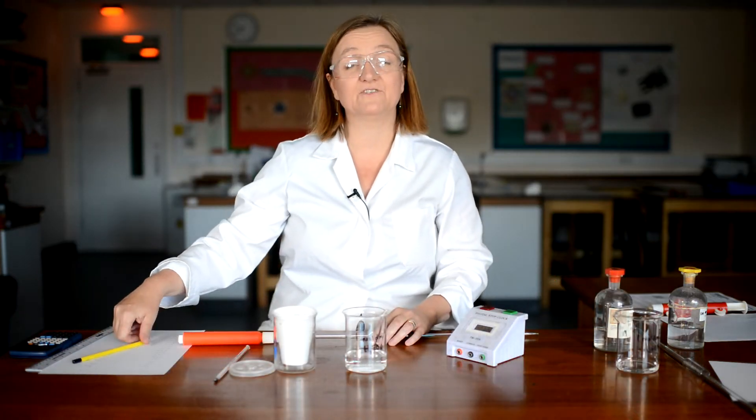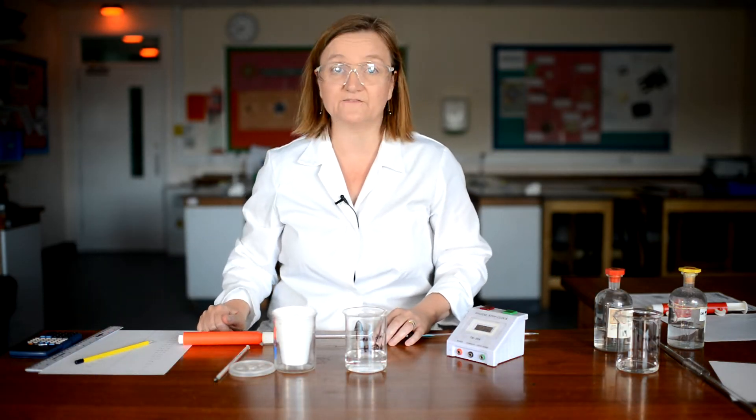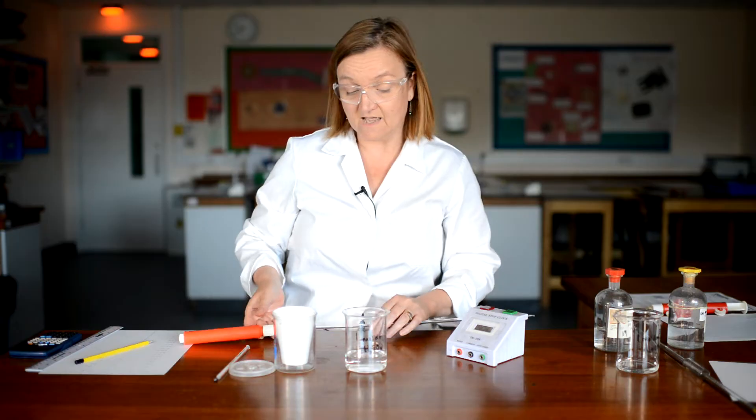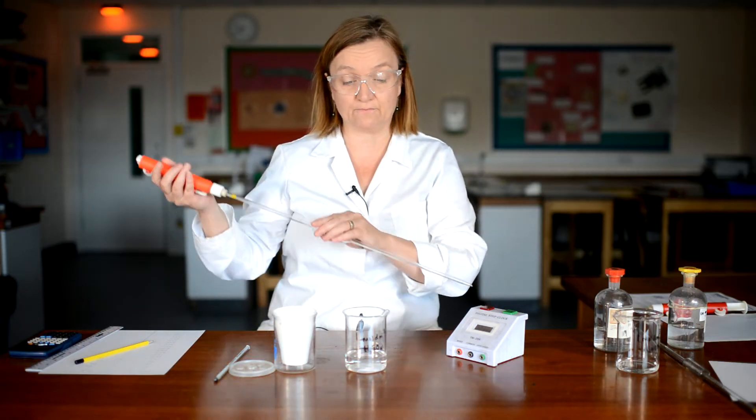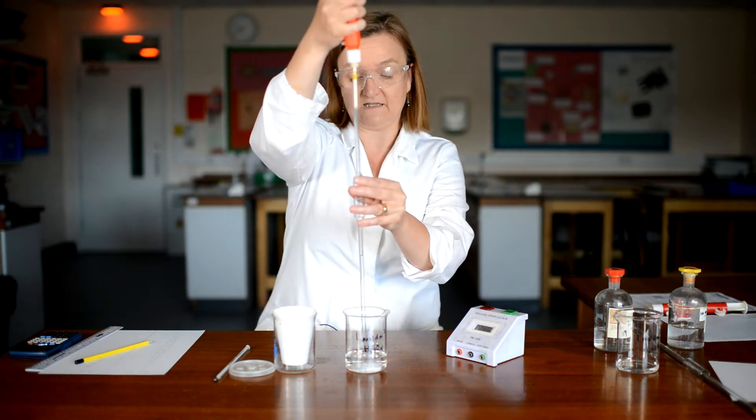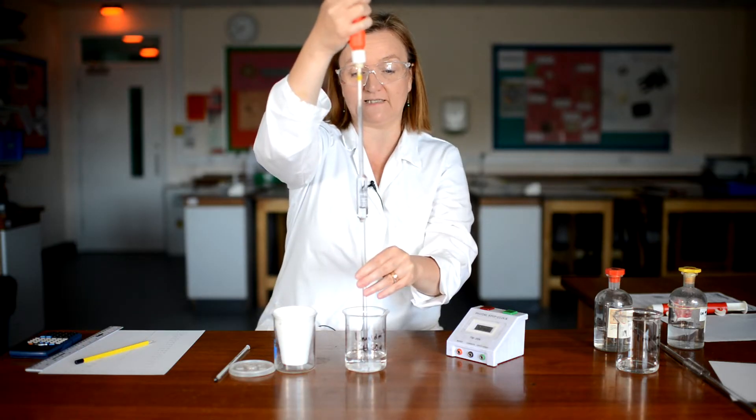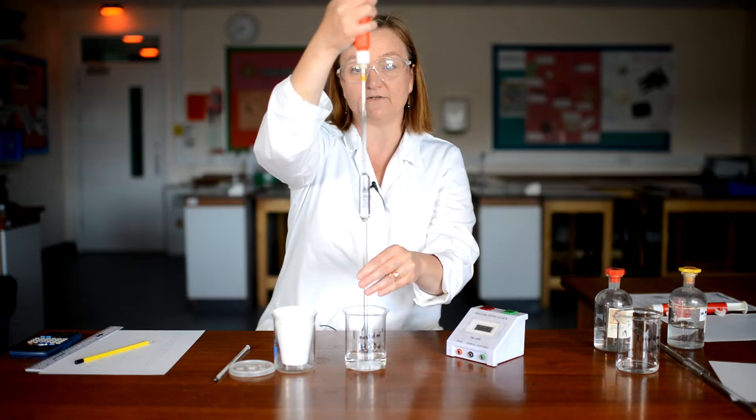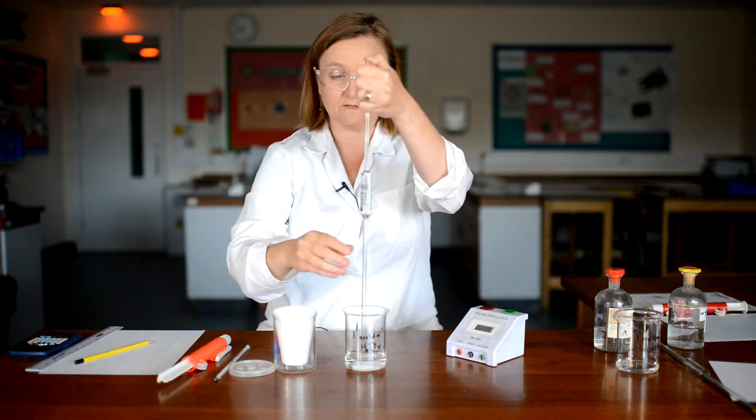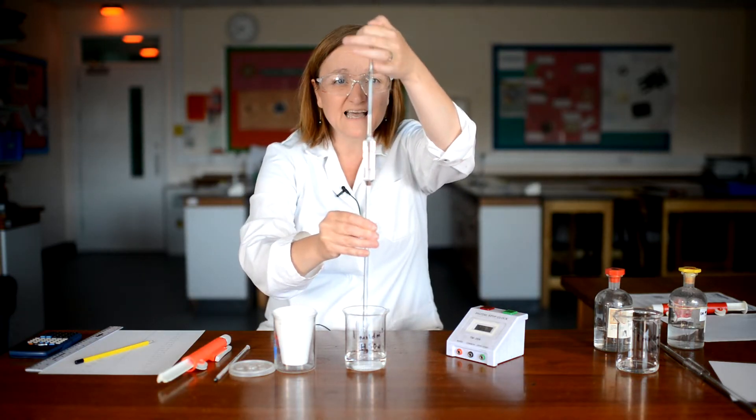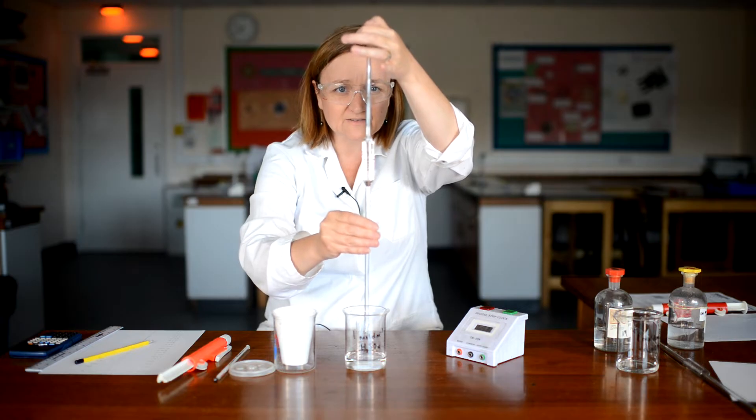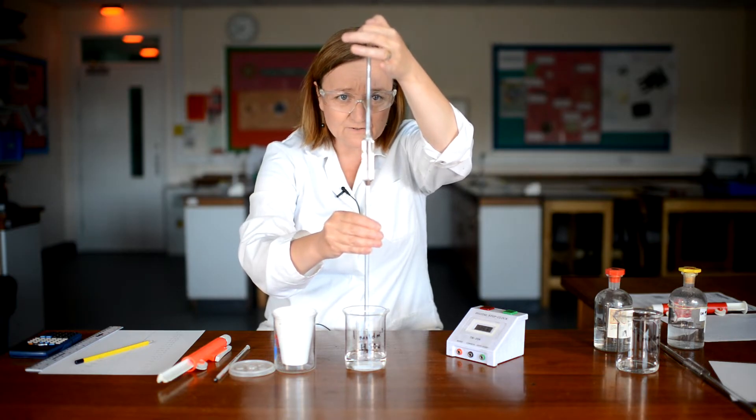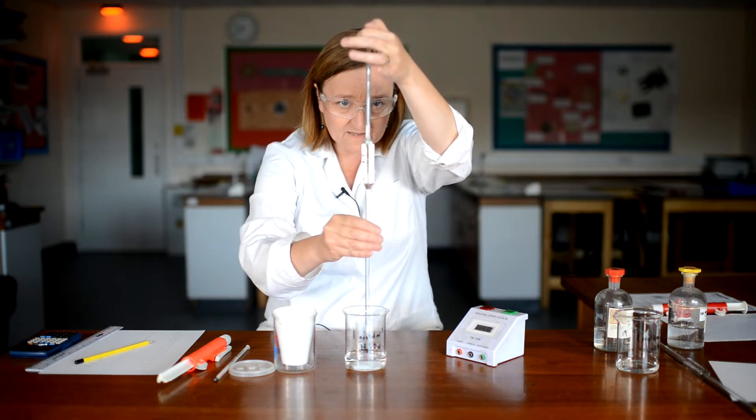So I've just taken my last reading of temperature at two and a half minutes and I want to add my acid at three minutes. So I've got 30 seconds to very quickly measure out 20 centimetres cubed of my sulphuric acid. So I'm using a different pipette. And again, just going to bring the meniscus down onto the line. So I've got it all ready to go in. There we go.